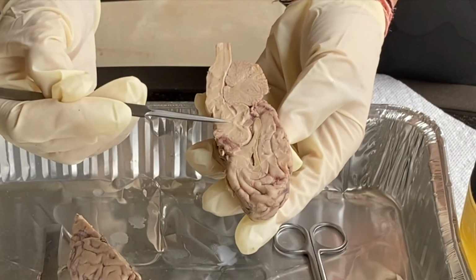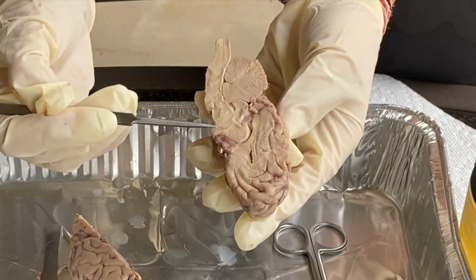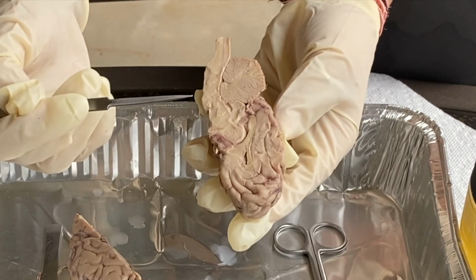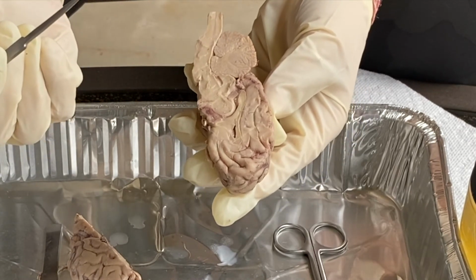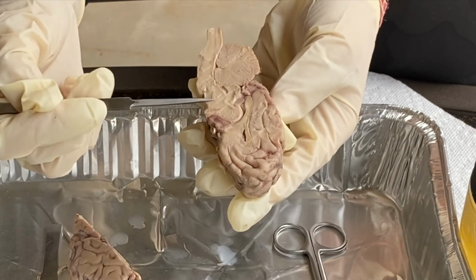So this part is the midbrain, which is basically located in between your hypothalamus, which is here, and your pons that starts here. It's associated with hearing, vision, motor control, your sleep and wake cycle, so your circadian rhythms, as well as arousal, alertness, and temperature regulation.